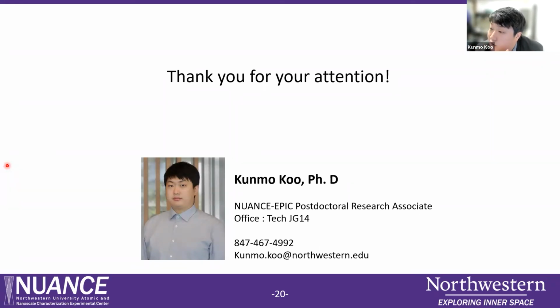Okay, so to be honest, the resolution of the graphene liquid cell should be lower than the conventional solid electron microscope, because there is a liquid layer which adds a lot of thickness-related contrast and aberration to your sample. But still we can achieve several angstroms of resolution. I did not include that slide in this presentation, but we can easily achieve 1.4 or 1.5 angstrom in the FFT information limit and the diffraction with the GLC.